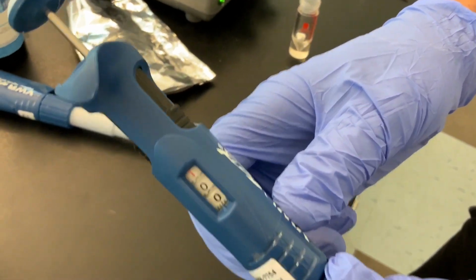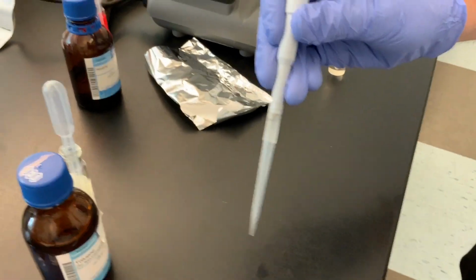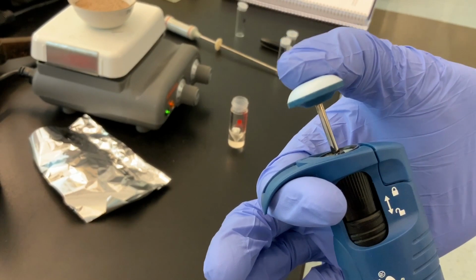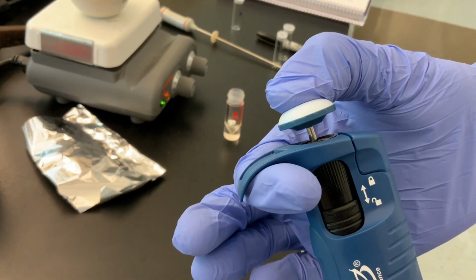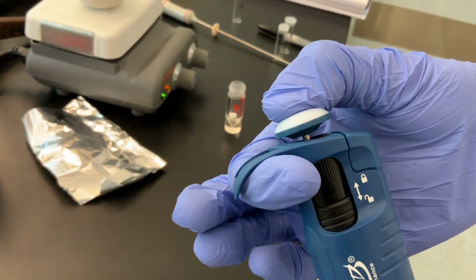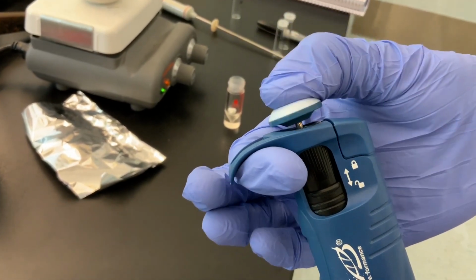Okay, all right, so these automatic pipettes, the depressor here has 2 levels of resistance. So there's this one here, which is easy to do, and then now my thumb is applying more pressure, and that's the second level of resistance of the depressor, or you could also call it a plunger, right?